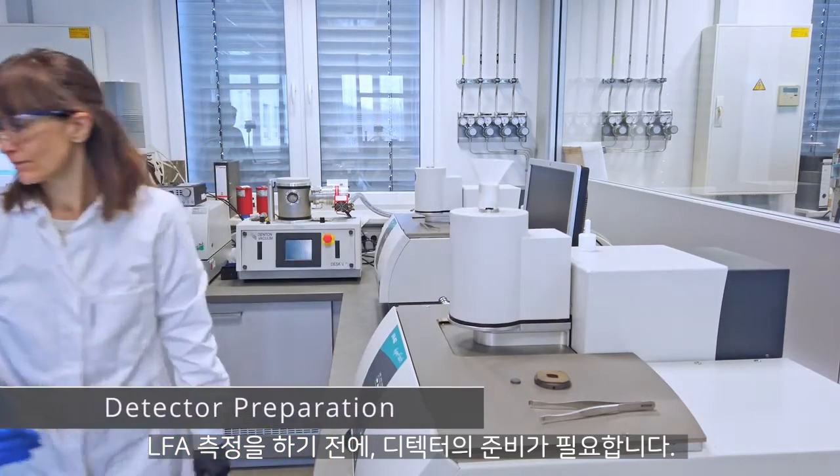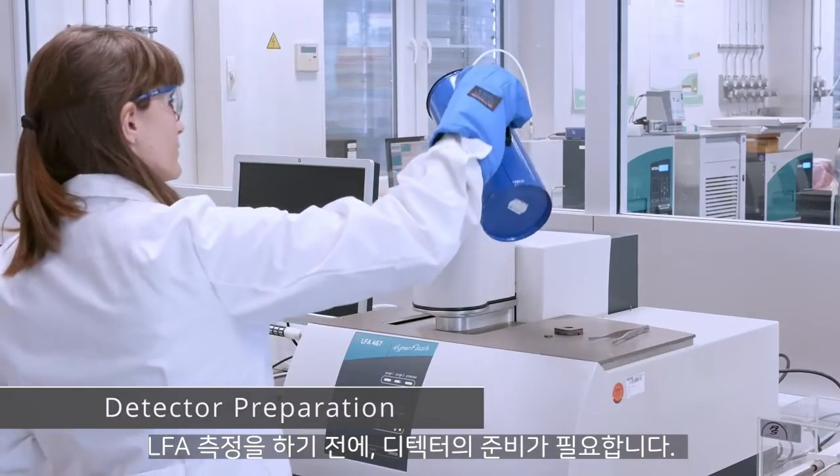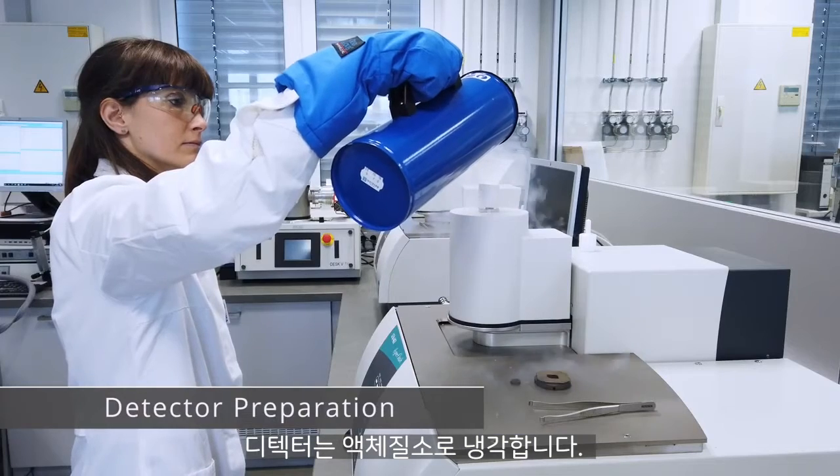Prior to an LFA test, the detector must be prepared. The semiconductor must be cooled down with liquid nitrogen.